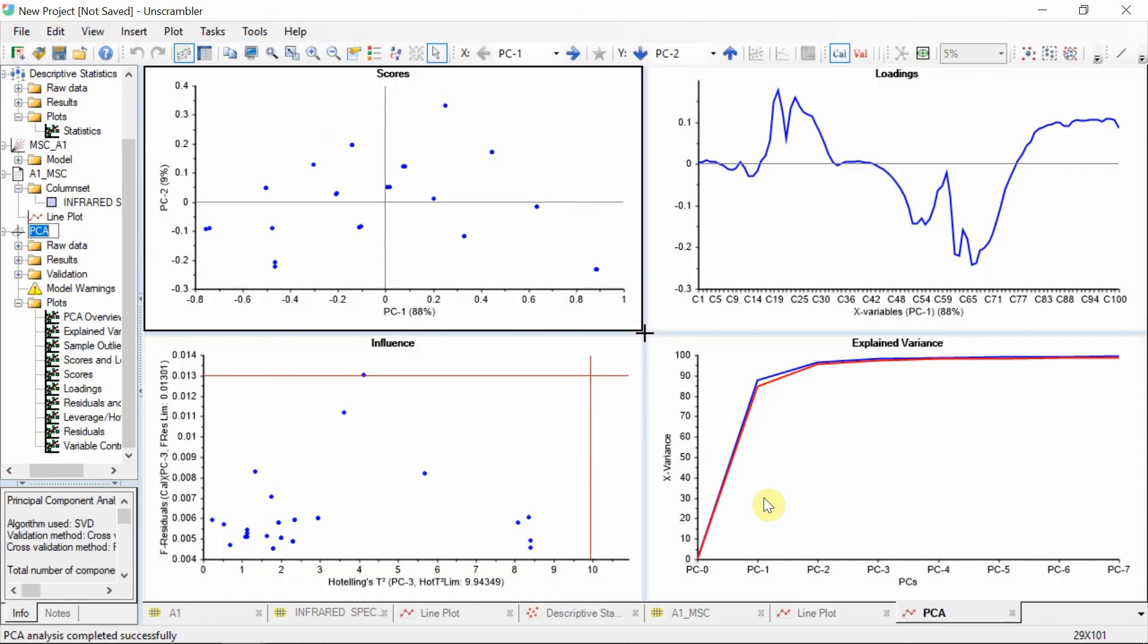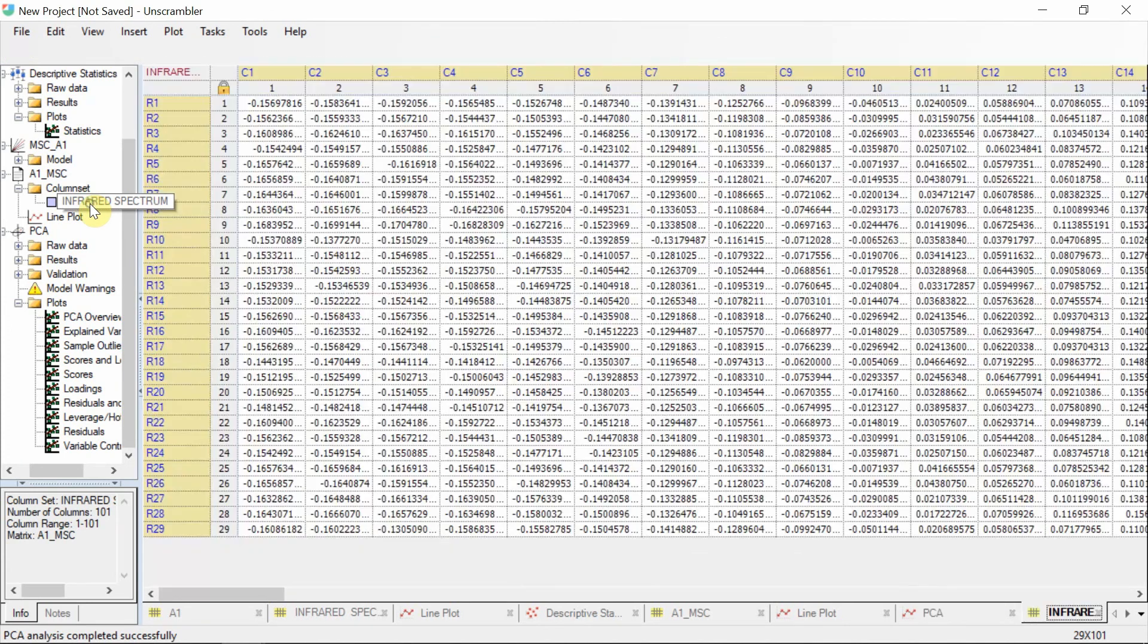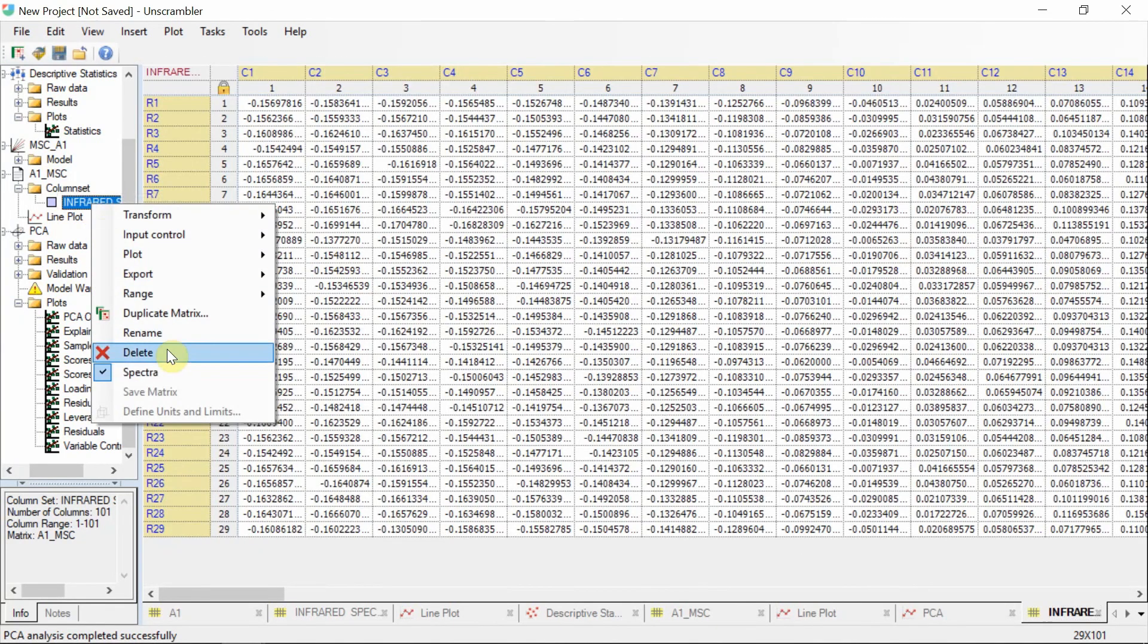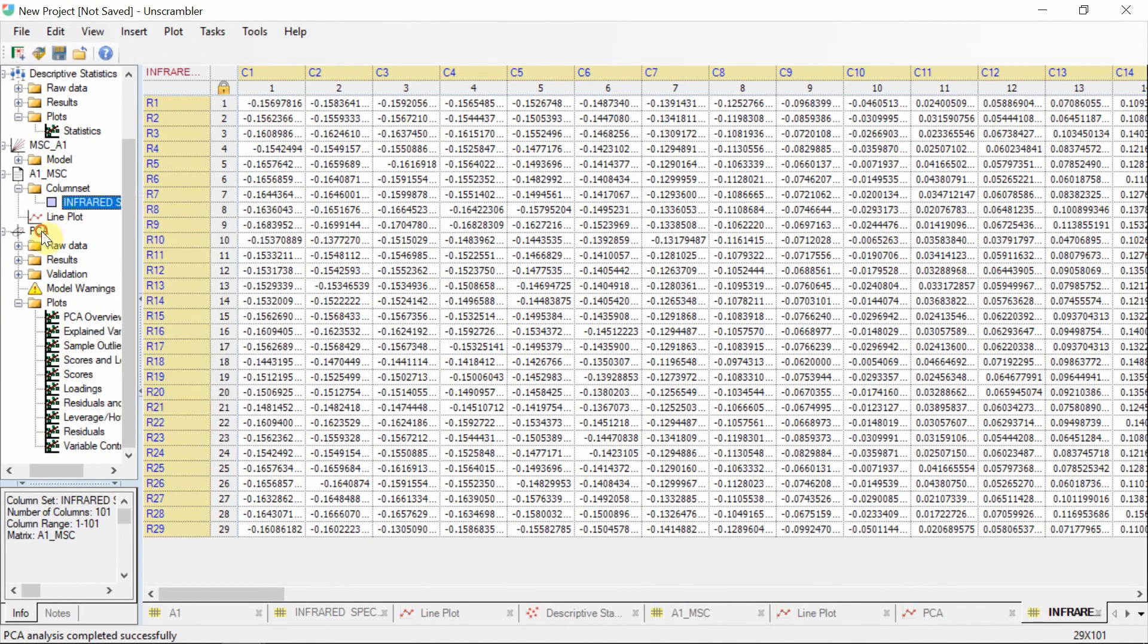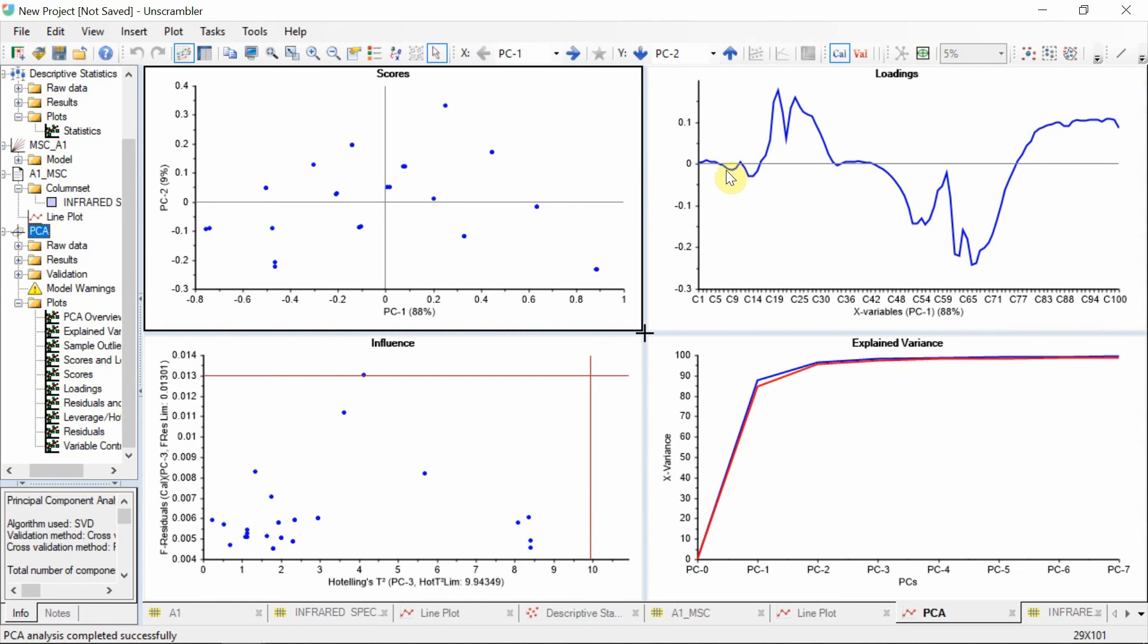Note that since we defined this data as spectral, the default view for the resulting variable plots, like the loadings plot, conserve the spectral shape.